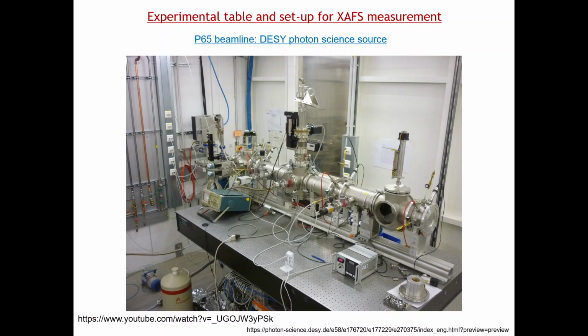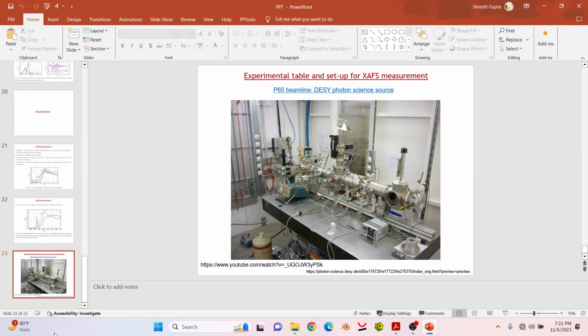Okay. So now if you want to understand the basics of how synchrotron radiation, or how this powerful X-ray, is generated, and how it is utilized to measure samples, I am showing you from a YouTube video.